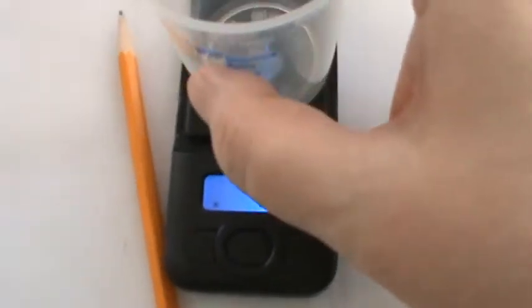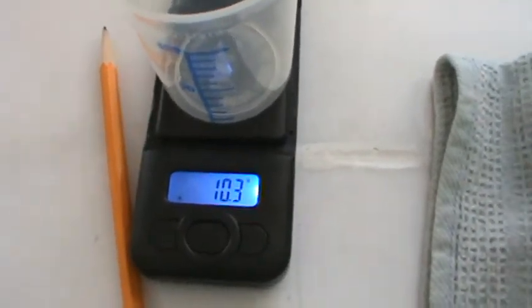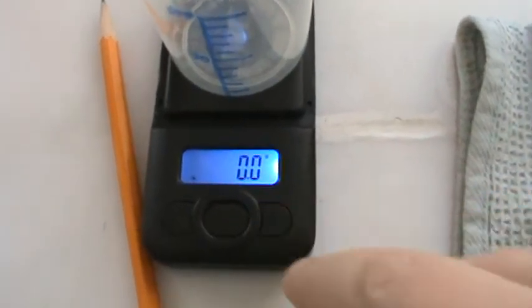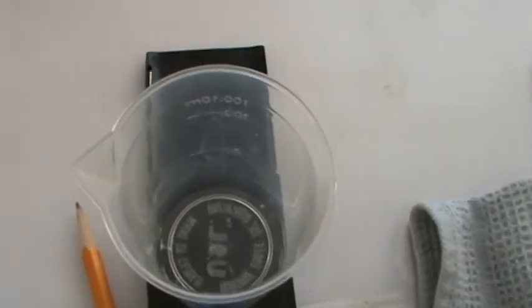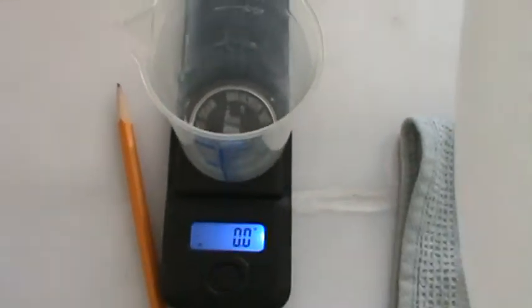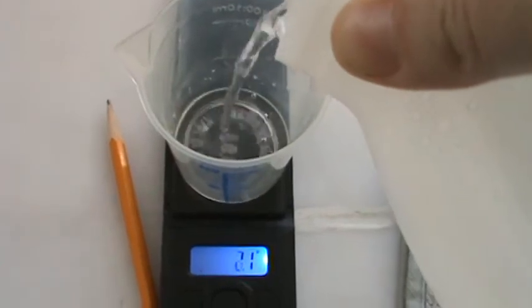Okay, so I'm coming over here and I'm zeroing out a little beaker. I don't know that I'm going to be able to get 196. I'll do it in pieces. We need 196.2 grams of vinegar, so we'll have to do this in bits, which is just fine.